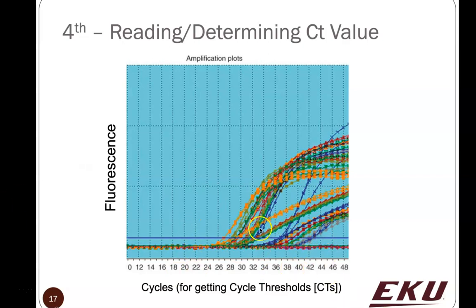So I don't know enough about the standard method and the actual calibration curves that are being used for this current kit, but we know that if you don't have any amplification, they're definitely clear, and there may be some point where these folks may be inconclusive. But if we amplify a lot of virus early on, in the form of taking the RNA to DNA, then we would know that that person had the virus in them at the time of the sampling.